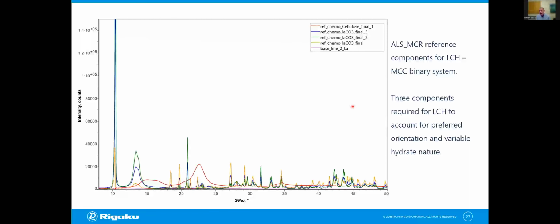So we collected, in the end, over 100 data sets on this system. We targeted 4 concentrations and we mixed multiple aliquots multiple times, so we could capture the full statistical variance associated with mixing. So we could estimate, if we were really using these data as standards, what sort of error would actually be introduced into the method itself.